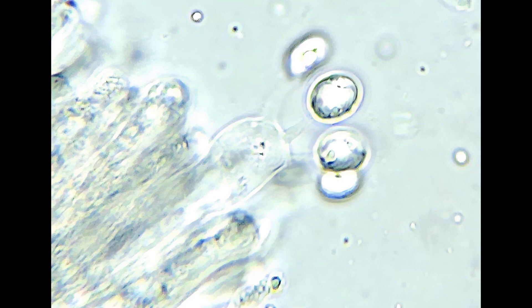So there's a quick little video of some fungal structures looked at through the microscope, and it did prove what I was wanting to know. It's fun to have a question and then be able to do the science and discover for yourself things like this — that yeah, even though these chanterelles are little and compact and dry and look a bit different, they're definitely producing spores and putting their spores out there. Now, how long can these spores last in the dry environs of summer until the rain comes? Probably the entire time — you can dry spores and fire them up on agar years later. So spores are maybe more like pollen than they are like seeds, because it takes a couple of them to sexually mate before anything really happens. But that's for another video.